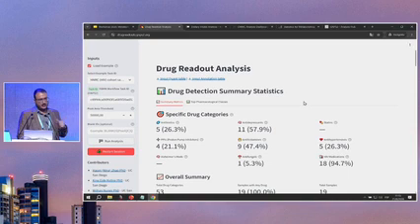For the drug readouts, we have the information from the analysis of those drugs and the samples that we already knew had those drugs present in them. To check that, you can basically just look at the visualizations. But if you really want to see the patterns and the fragmentation, then you need to download those tables here.